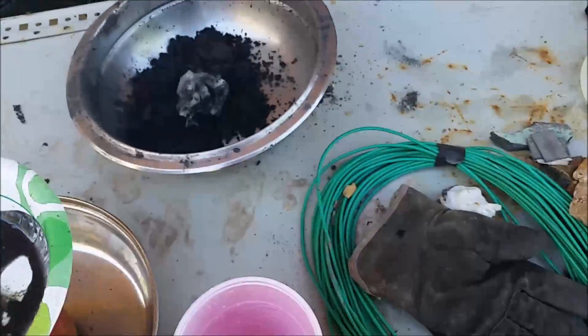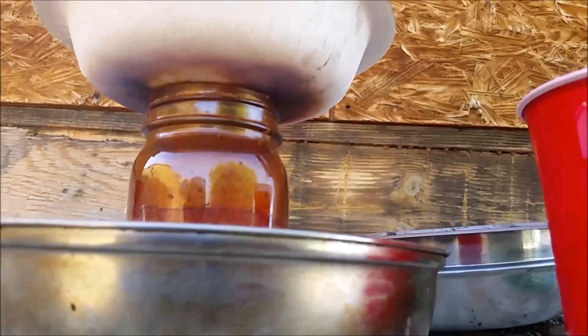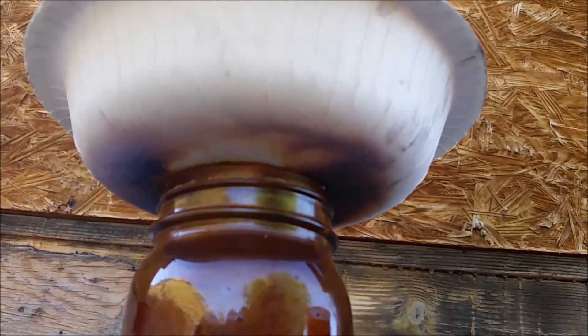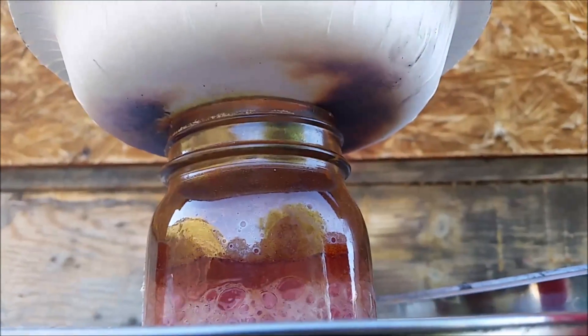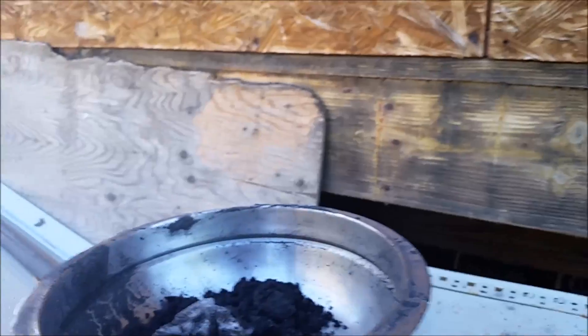Cover that. That's iodine right there — holy crap, I wasn't expecting that. Look how purple! I should have used this pan — yeah, that would have been better.